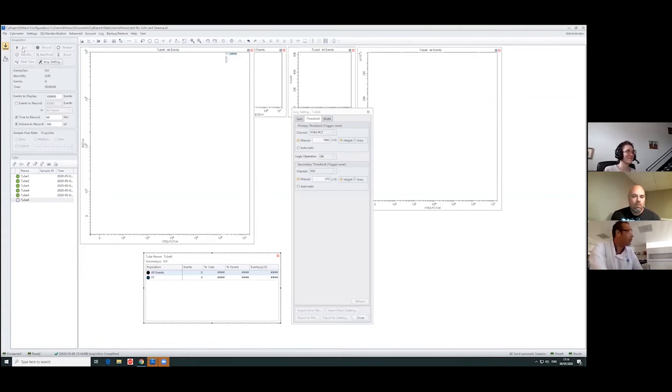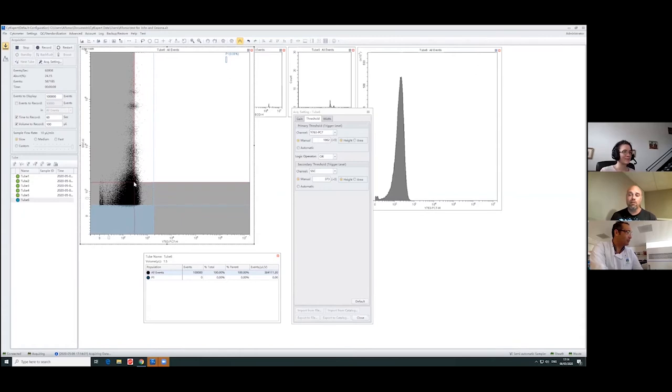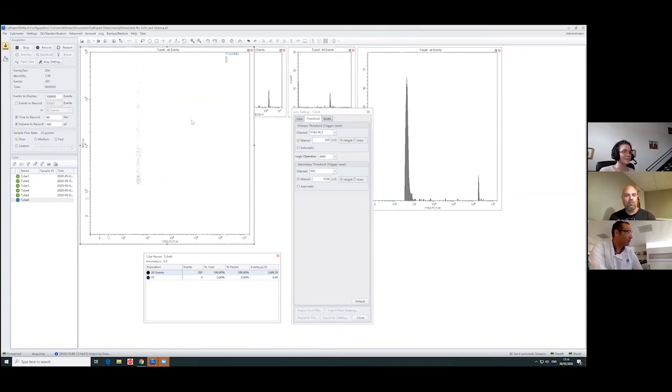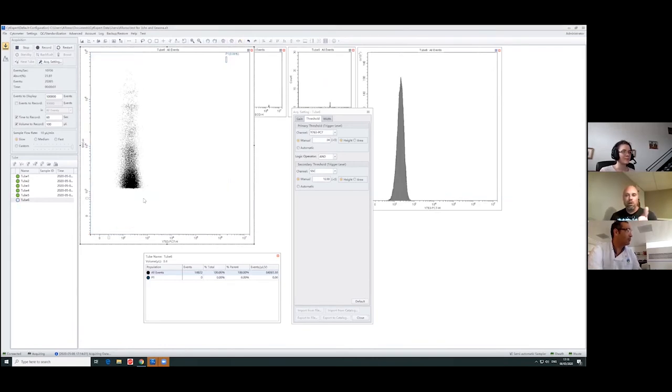All right, so I'm going to wrap this session, but I want to point out some things that Alfonso has made very clear for us. One, Jenner had asked about cleaning the system. Well, just putting on a PBS and seeing those beads would allow you to understand what you need to do to clean up, right? So you start a protocol of how to clean that out. Secondarily, we said you could use that just as a control. If you added a little bit of a large bead in, you could use that, knowing that it's going to show up in the same spot every time, to make sure that things have not fluctuated between samples.